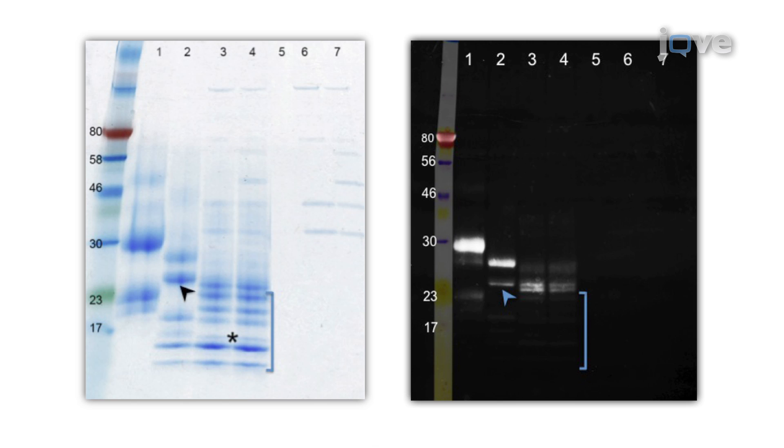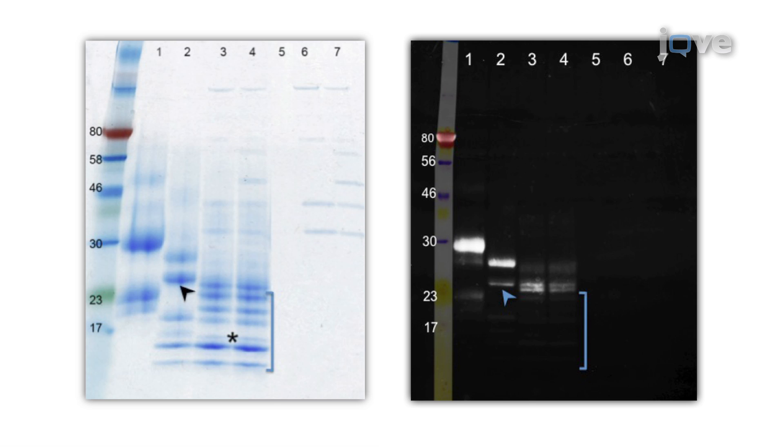Results are obtained which show that HCG beta is heterogeneously glycosylated and contains multiple glycoforms based on the differences in protein migration with and without glycosidase treatment and the diminished signal on ProQ staining as the glycans are successively removed.